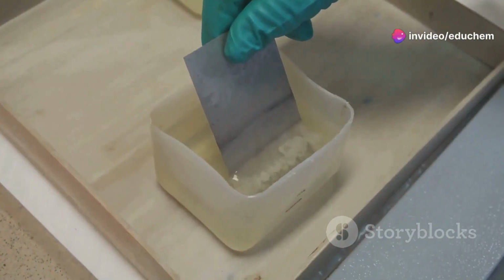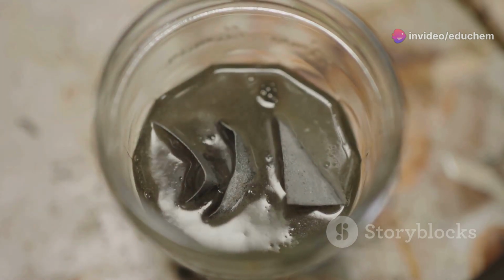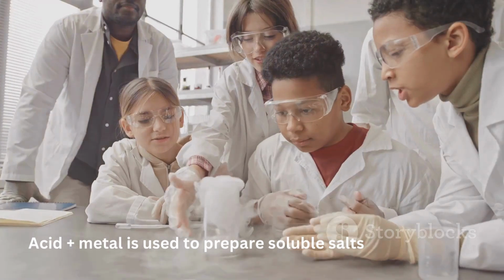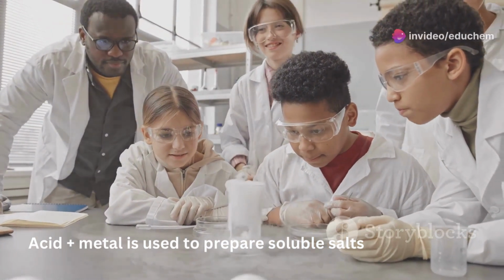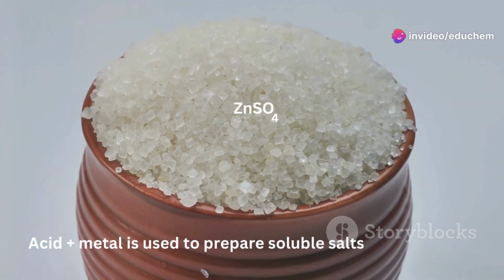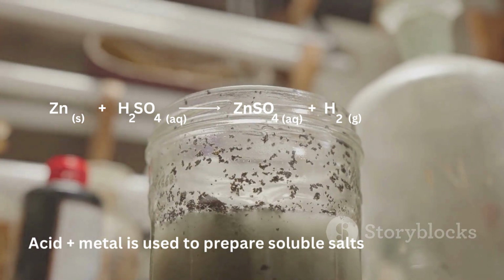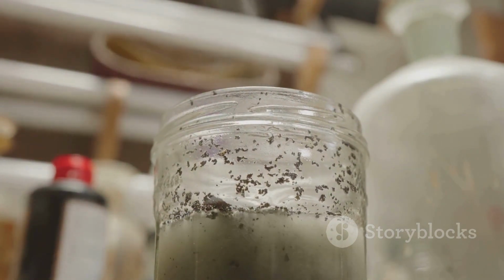Preparation of salts by reaction of acid with metal. The reaction of an acid with a metal produces hydrogen gas and a salt. This method is typically used for preparing soluble salts of moderately reactive metals. For example, if you want to prepare zinc sulfate, you can react zinc with sulfuric acid, which produces zinc sulfate and hydrogen gas. The steps are as follows.